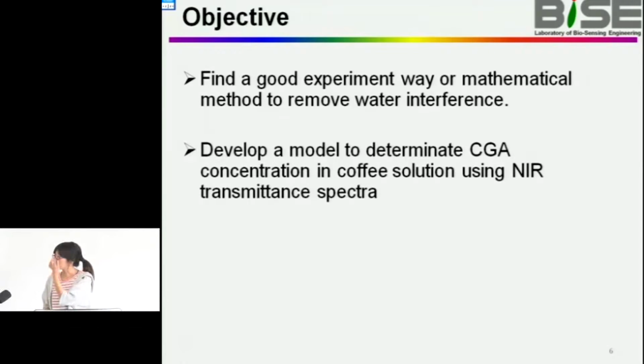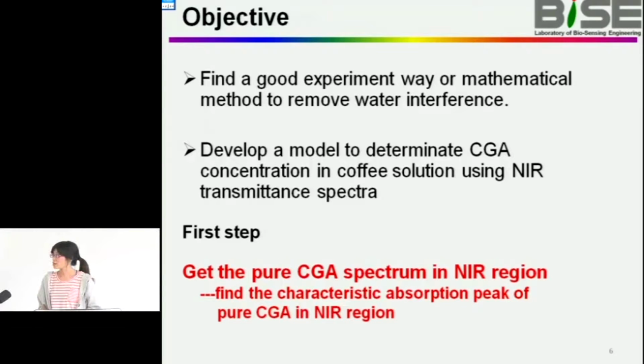Before I measure the coffee solution, as the first step, I want to measure the pure CGA solution in the NIR region to find the characteristic absorption peak of pure CGA in the NIR region.